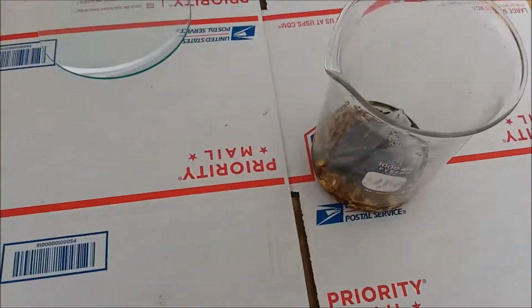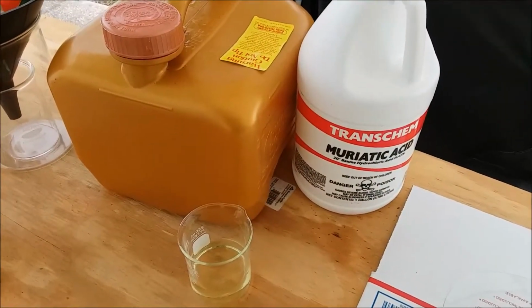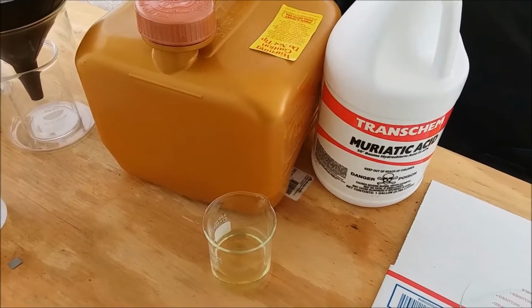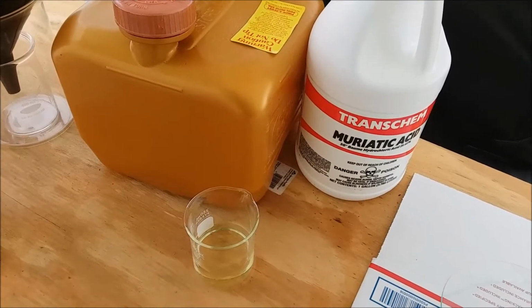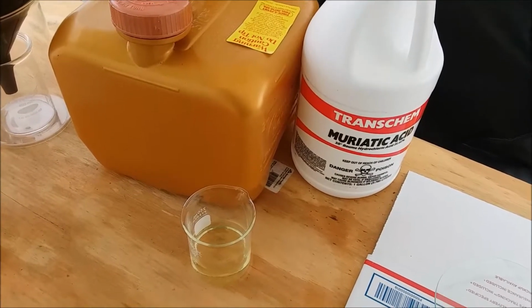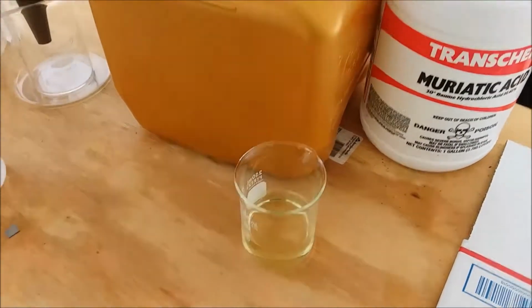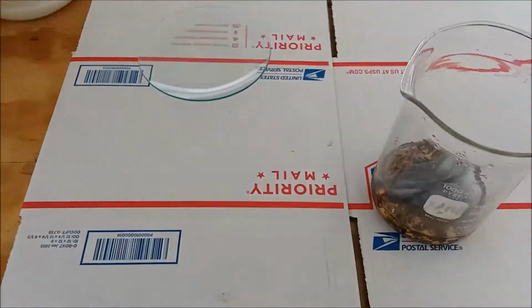And what I'm going to do is dissolve this gold with a mixture of muriatic acid and bleach. I'm going to use the chlorinating bleach I use for my pool, which is a highly concentrated sodium hypochlorite bleach. I've already dumped a little out into a beaker here out of this big container, and I'm going to be a little more conservative this time.